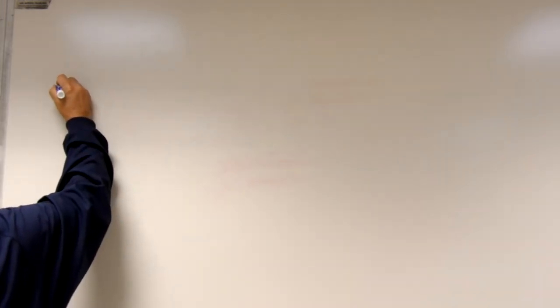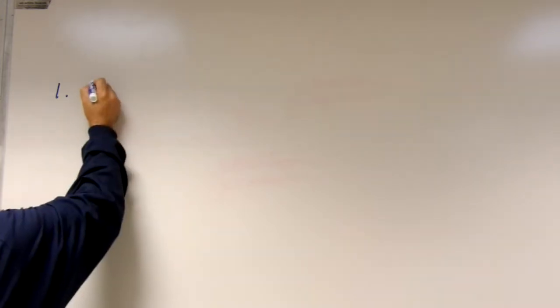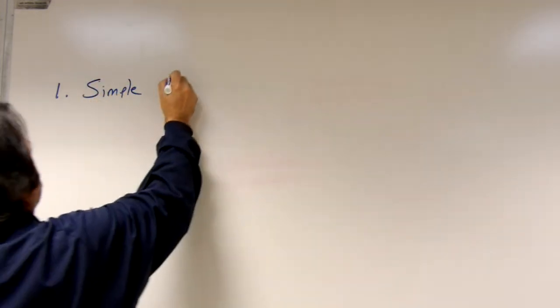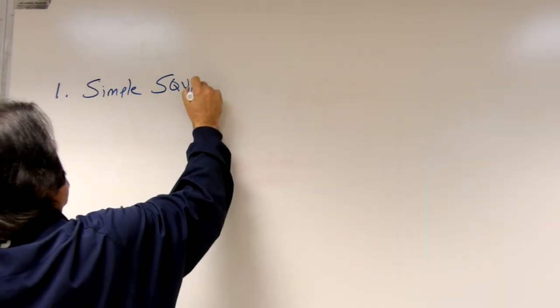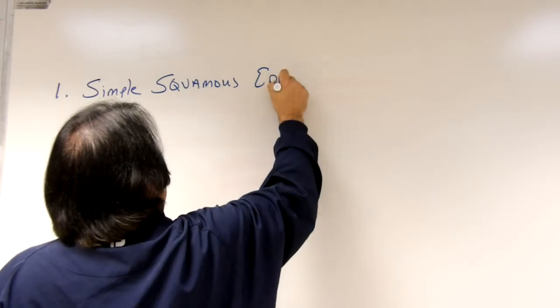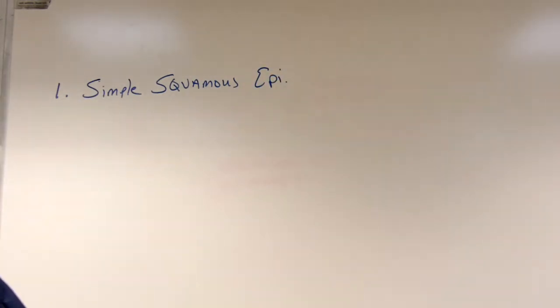All right, we'll start with our first tissue, number 1. Okay, epithelial. Simple squamous epithelium. Okay, need to make sure you understand all 3 of those words.